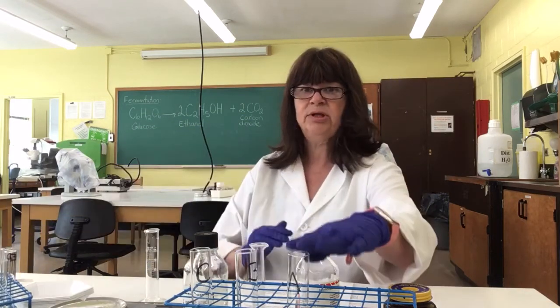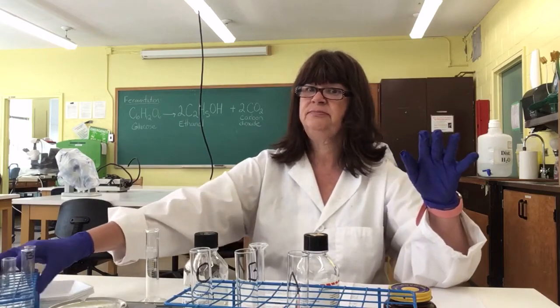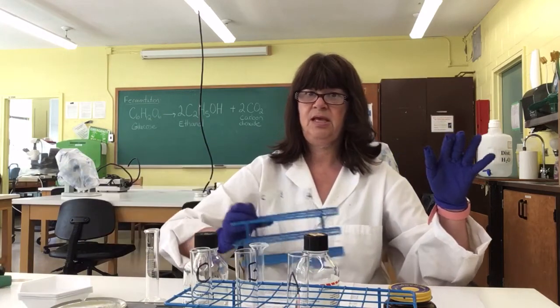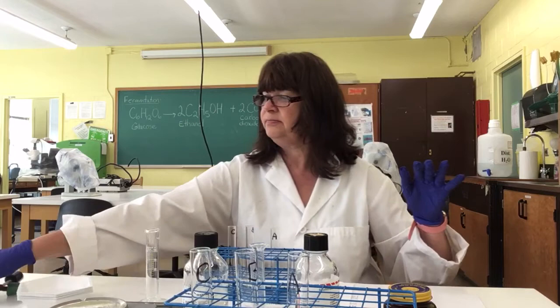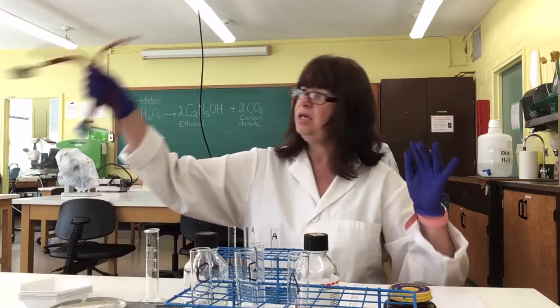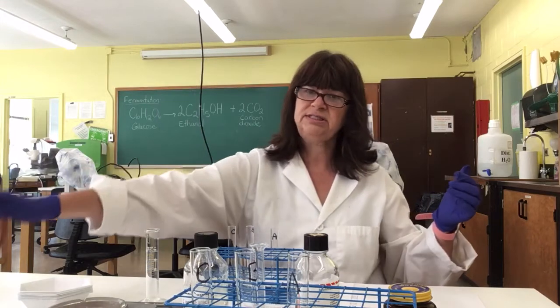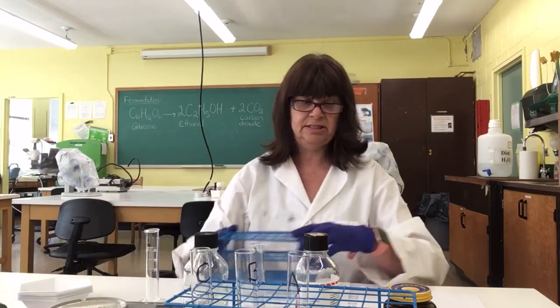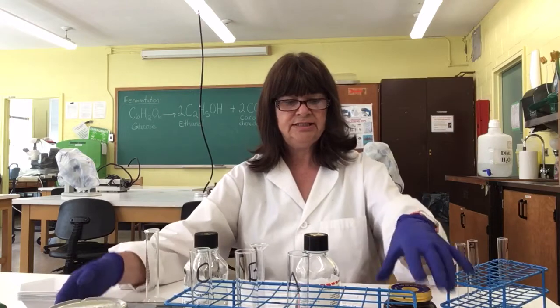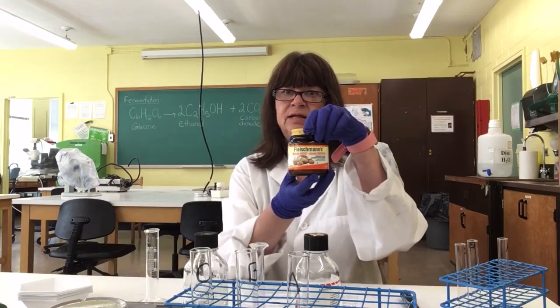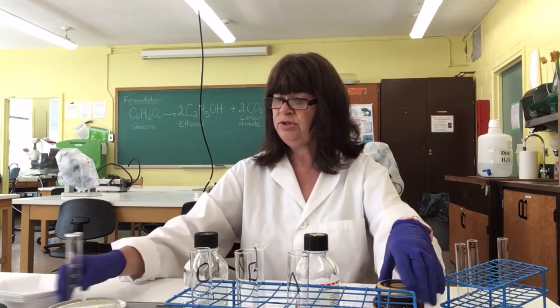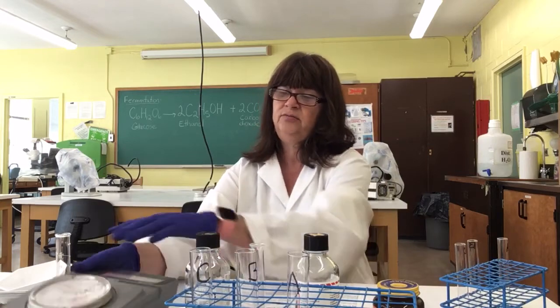Connecting the boiling tubes to the test tubes will be these three rubber stoppers with connected rubber tubing. So once it's all set up we'll see how that is going to work. To weigh out the yeast, this is the yeast that I'll be using, I will use this weight scale right here.